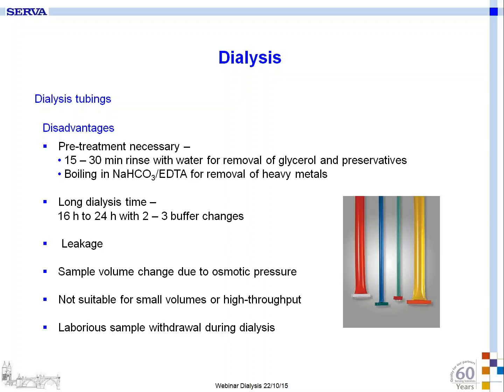So you have to at least rinse them with water for at least 30 minutes to remove the glycerol and preservatives. And if you have more sensitive applications, you even have to boil them in sodium hydrogen carbonate and EDTA for removal of heavy metals, sulfides, and other contaminants. And you need very long dialysis times, around 16 to 24 hours, with at least 2 to 3 buffer changes to get really good salt removal and removal of other contaminants.